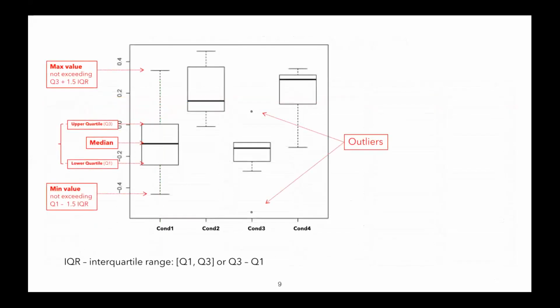Okay, so now the important thing before we start looking for specific genes: as I was telling you, we need to look into the whole data set and understand whether it is good data or not, and whether we should proceed with it or not. What are the statistical features of this data set? That is something we are trying to do here today.